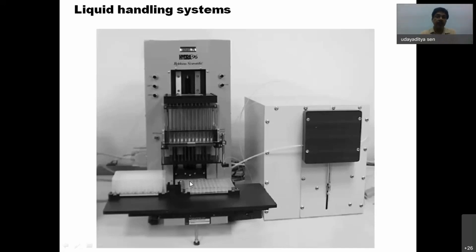So first you use this syringe. Then with the syringe you take your protein and put in this 96 one. Then you add this 96 kind of precipitant, and that 96 well can be used again after washing on the 96 well crystallization condition, crystallization trays. So you can mix them and wrap it with the plastic thing. You can cover this, and equilibrium goes. In that way, in a few minutes you can set some 96 or 100 drops, and you need very less amount of protein, very less amount of other reagents also.